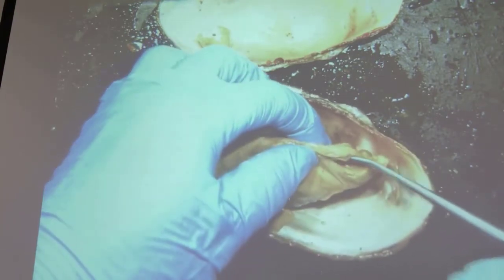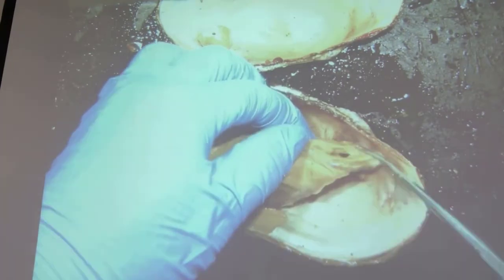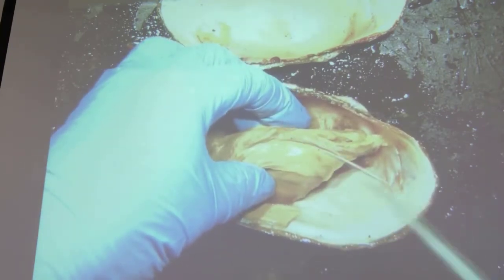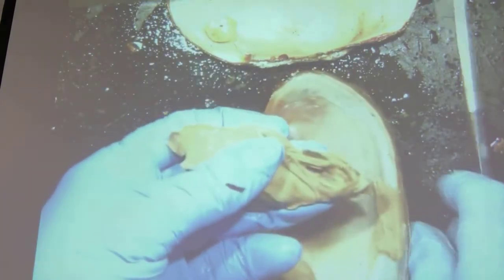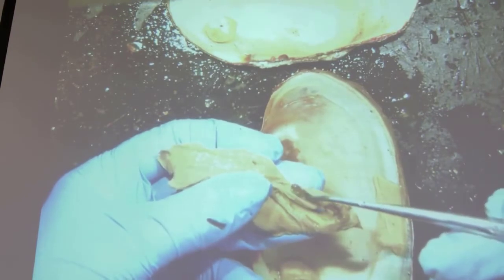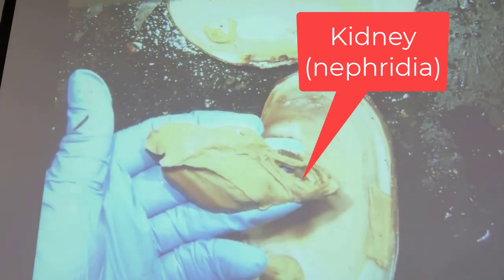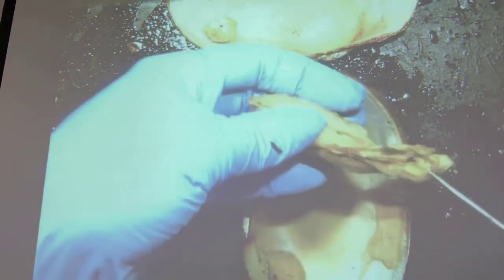So this is the heart. What's interesting is that the intestine actually goes through the heart. So this is intestine that's coming through, and here's the heart, and the intestine continues through here. As we open up the structure a little bit more, we can see that underneath the heart, there's this dark structure here. That is the clam's kidney. So that is the kidney, that dark structure.